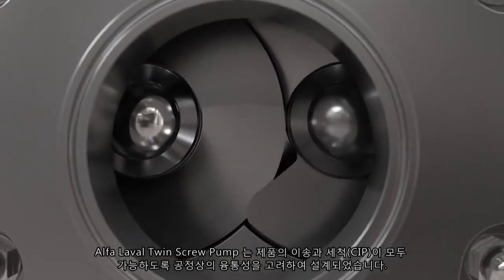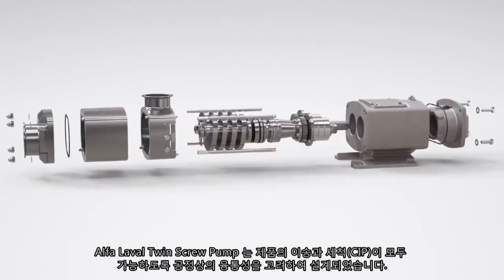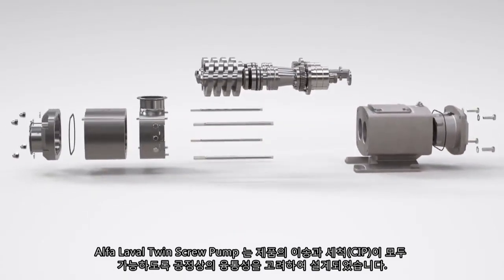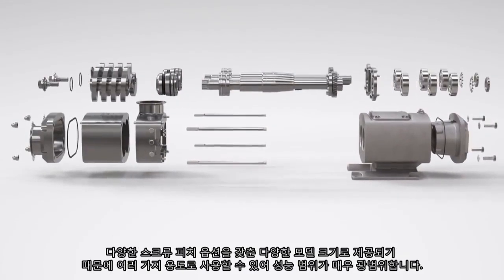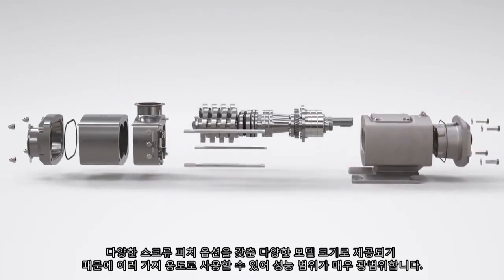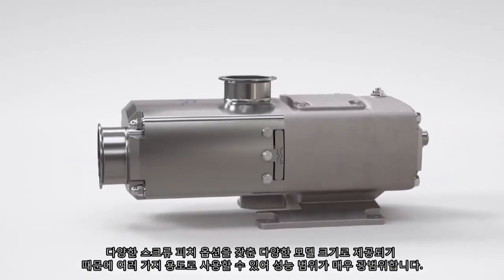The Alfa Laval twin screw pump is designed for process flexibility to handle both product transfer and cleaning in place, with the ability to move seamlessly between the two. It consists of multiple model sizes with various screw pitch options to cover a wide performance envelope, allowing for multiple applications.